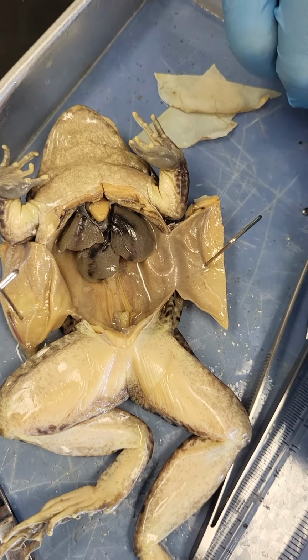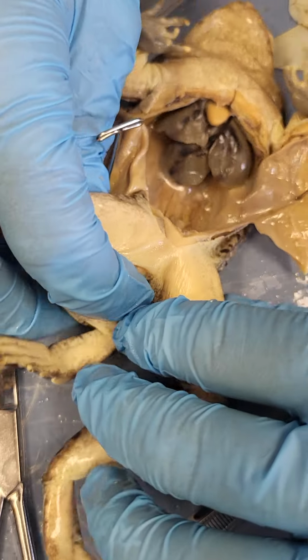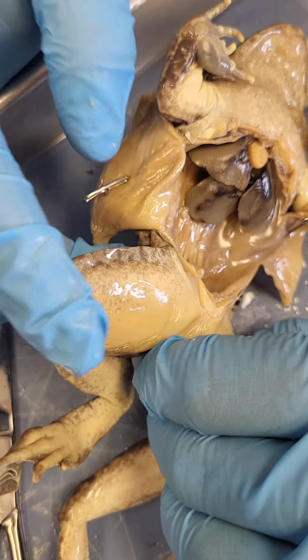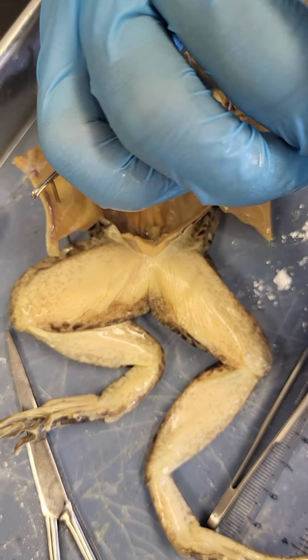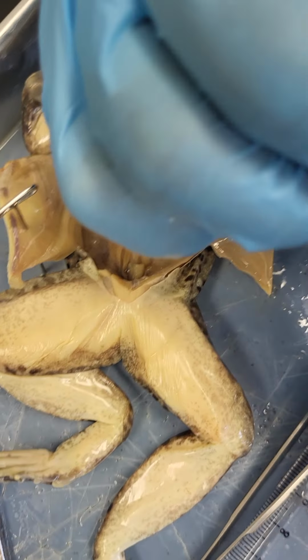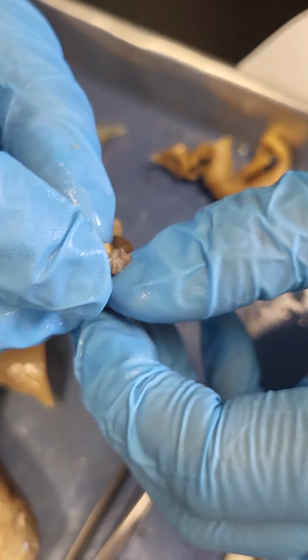Does it have testicles? No, because the kidney doesn't even have blood. He said does it have testicles. It should be on the top of the kidneys. Come on. It should be at the top of the kidneys. The stuff that's around. I would rather not want to know if it has testicles. No, I was talking about something else. Oh, okay. Ooh, testicles. No. Yes, it does, it does. It does? It's a male. It's a male. Okay.